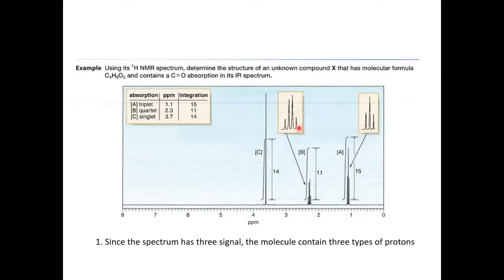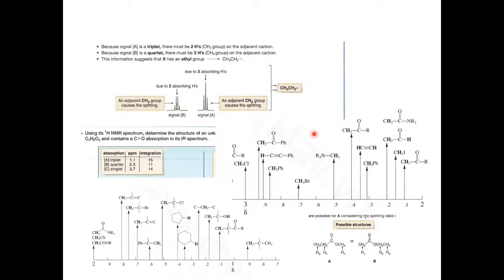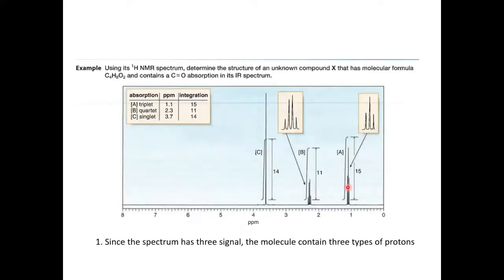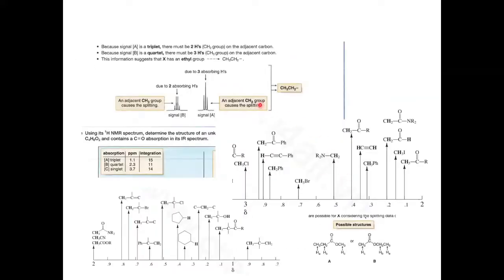So this is due to CH3 proton, this is due to CH2 proton, right? So integration also give this 2 value, this is a 3 value. So from the integration you can see here the 2 protons and 3 protons are there. This one 3 proton, 15 integration, this one. So from integration and splitting pattern you will receive the ethyl group.